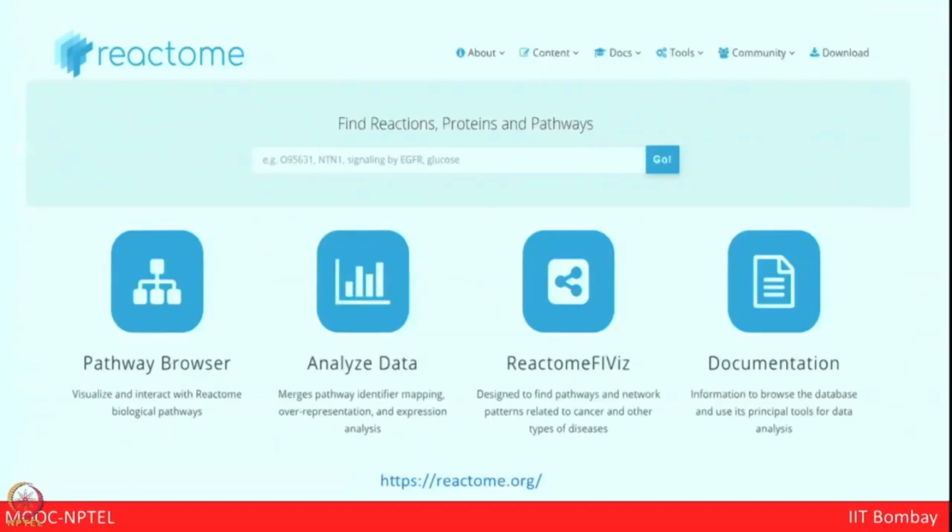Now I will be talking about a very new but widely used software, Reactome. Reactome is a database which can help you link your proteins, your candidates, with different kinds of pathways. This software is so robust and dynamic that it will not end with giving a single pathway; rather, it will give you different sub-pathways and sub-networks, followed by single reactions.